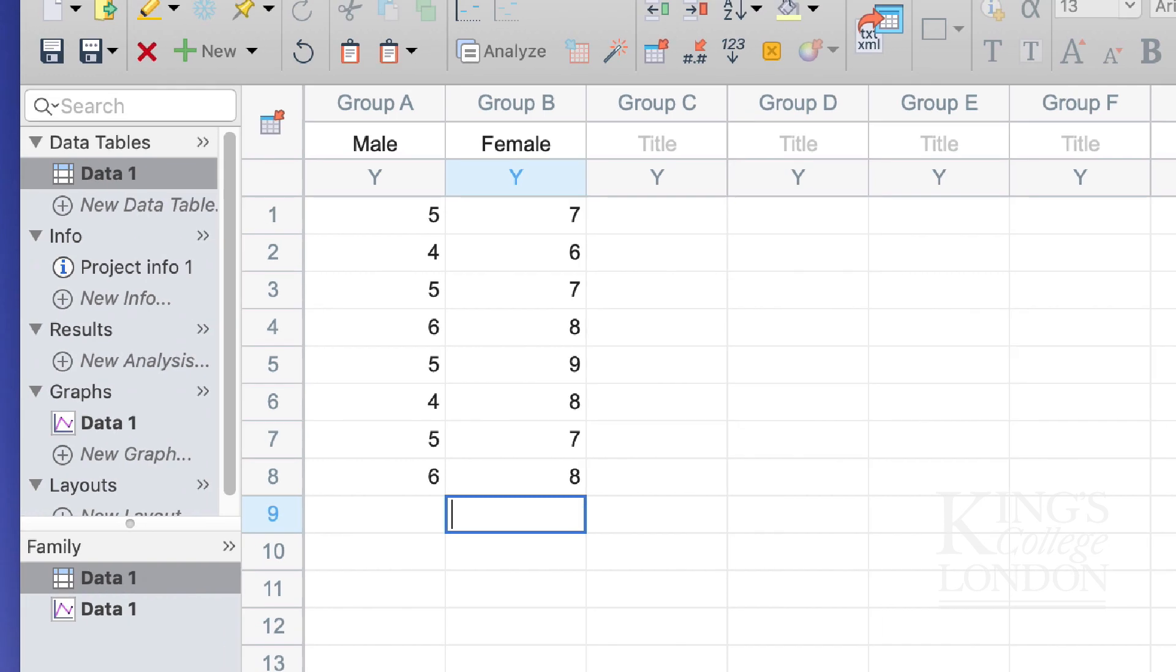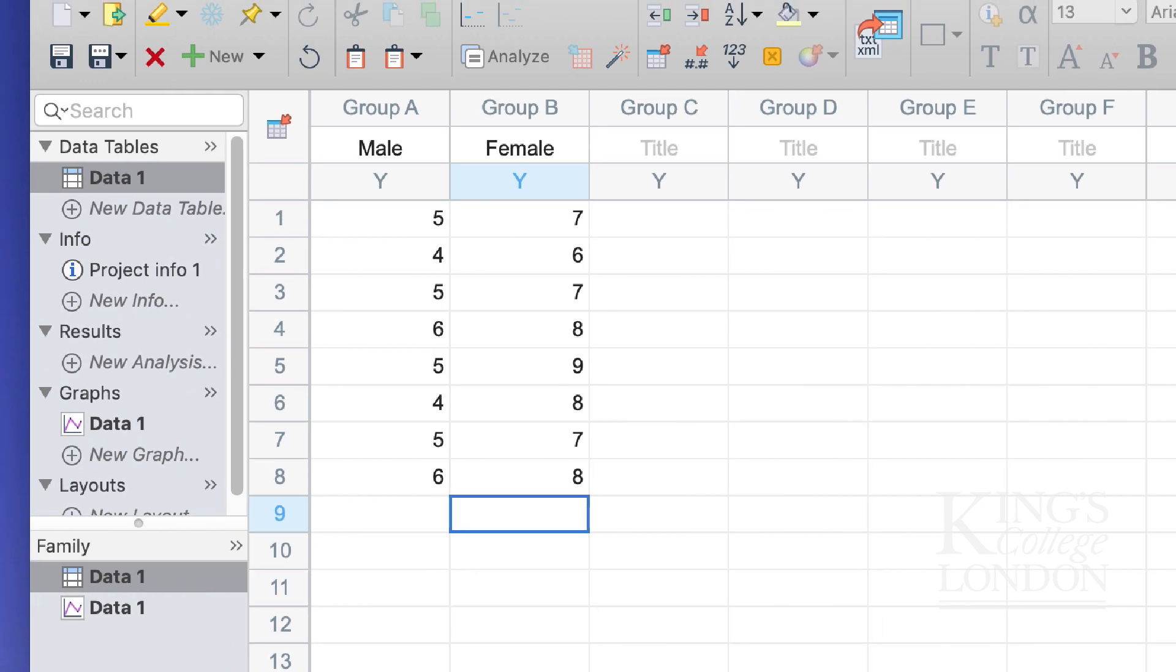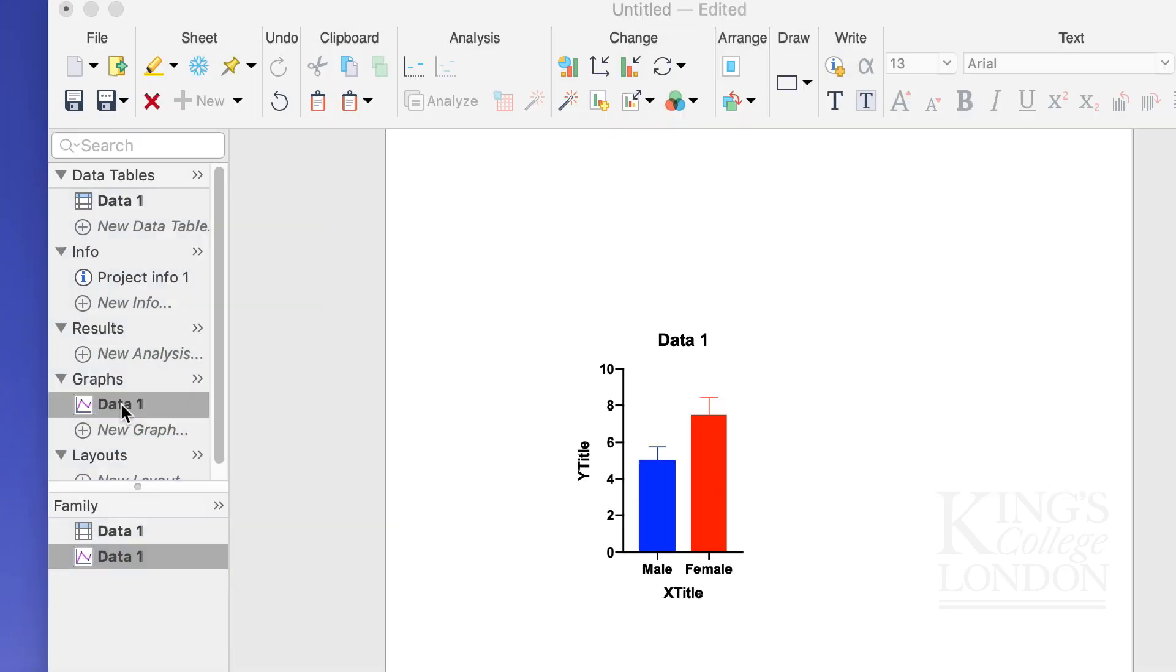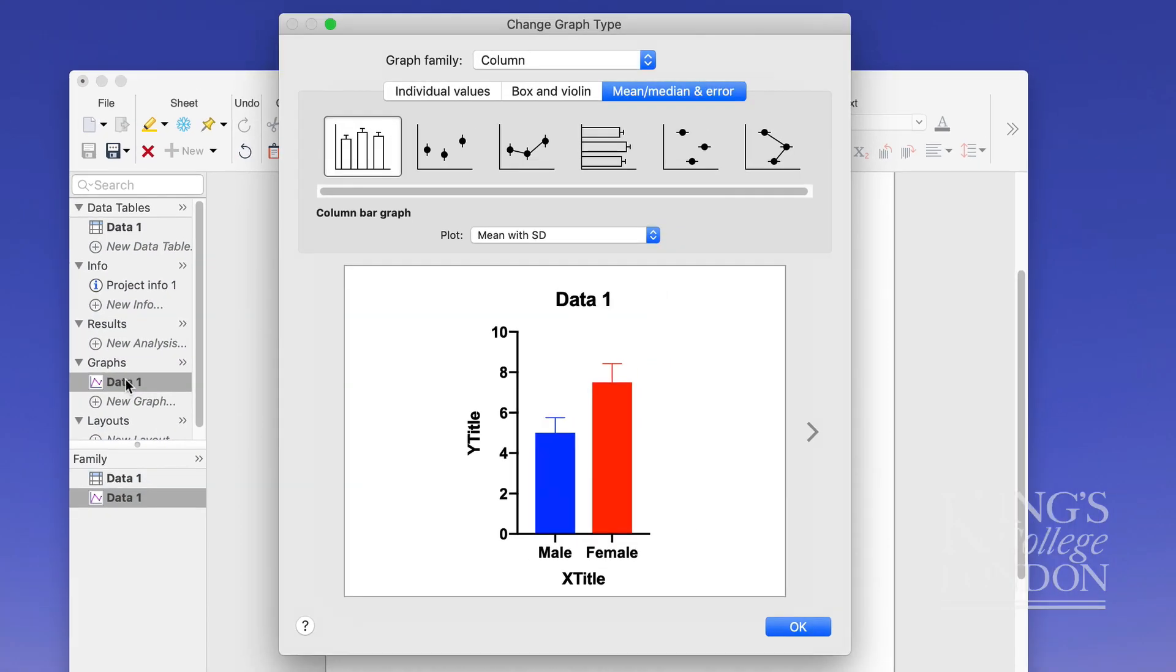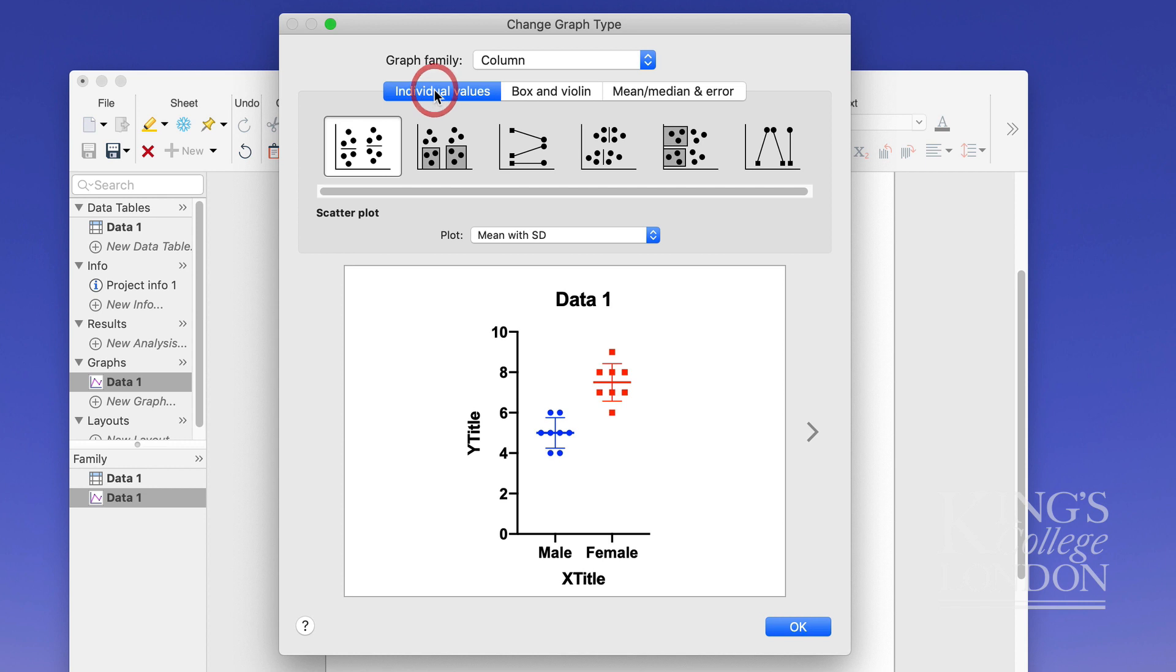Prism is quite an intelligent program and while you've entered those data it will automatically create a graph called data1 and if I click on that you'll see it's comparing these two different data sets. As soon as you click on the graph you'll be presented with a window selecting how you want these data to be displayed and to be honest it doesn't matter to me at the moment but for visualization purposes I'm going to choose individual values as a scatter plot and click OK.